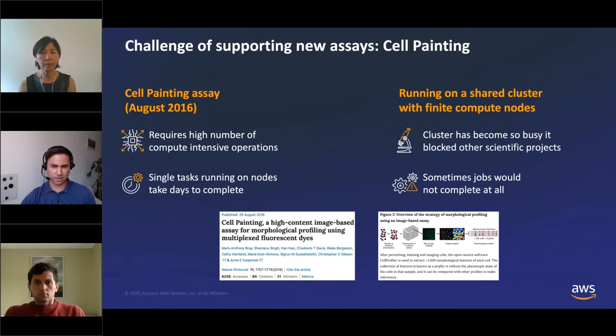So to give you a little bit of background on the scale, before cell painting, you would typically extract features from an image. They would be somewhat high level. Maybe they'd be in the hundreds at the most. This would be written out into a tabular CSV format, maybe a couple gigabytes, nothing that was too crazy to handle from an infrastructure perspective.